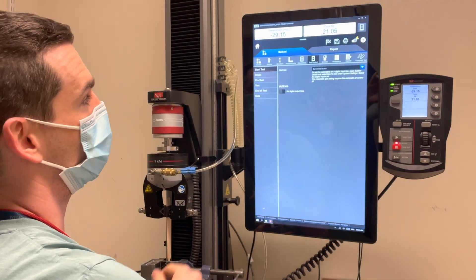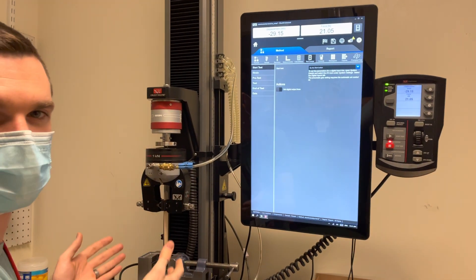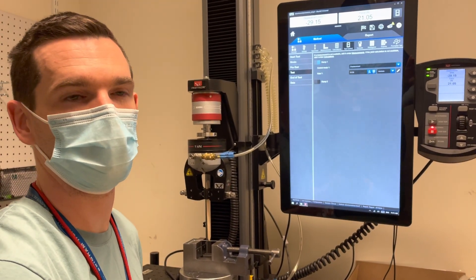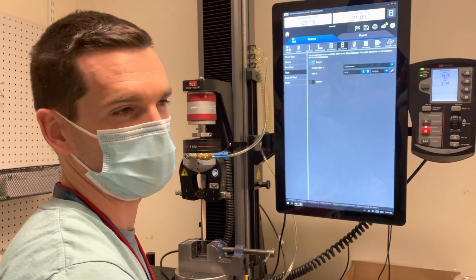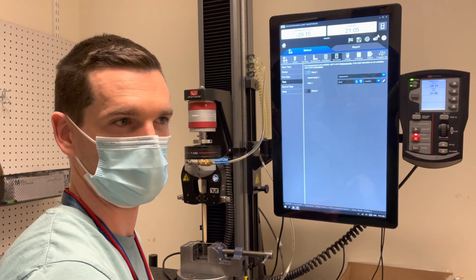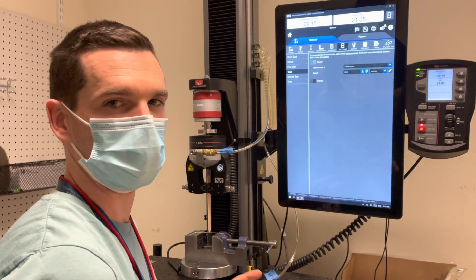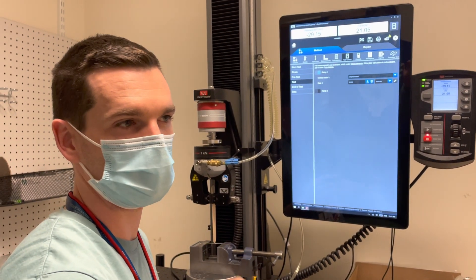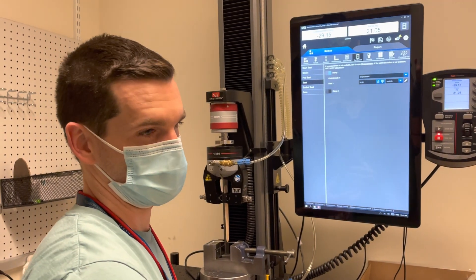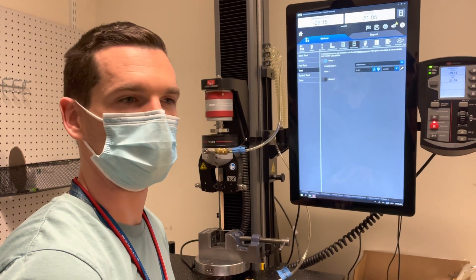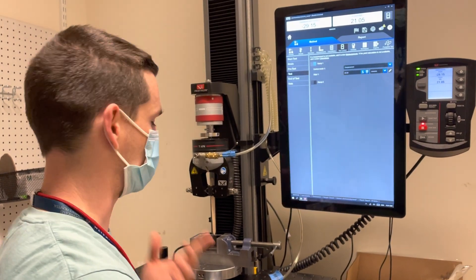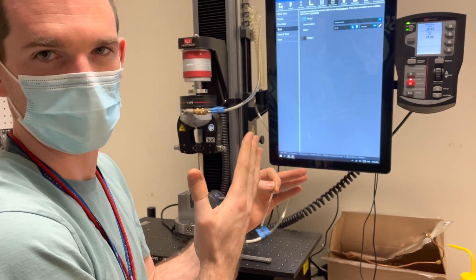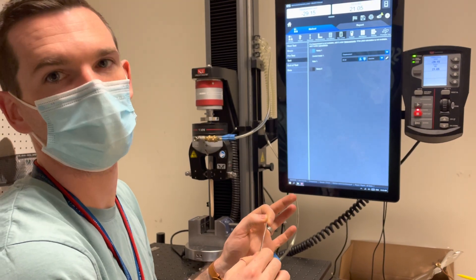In my test control tab, I'm controlling the strain rate — how fast the crosshead is moving — which depends on the material type. If you're unsure of how fast it should move, look up an ASTM test method. If you're part of Brigham, you have access to Harvard Hollis, their online library database, where you can look up ASTM Compass — the database of all ASTM standards. You can look up standards for, say, elastomeric tensile testing, and it should give you a millimeter per millimeter value. For example, if your gauge length is 50 millimeters and the standard says one millimeter per millimeter, you would test at 50 millimeters per minute.